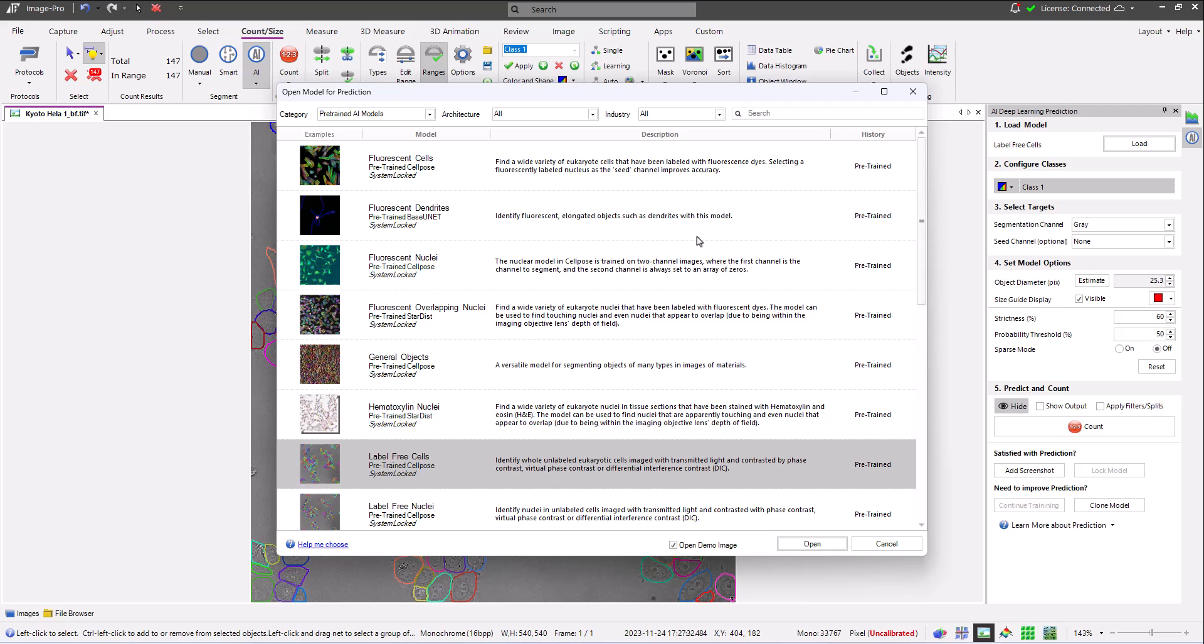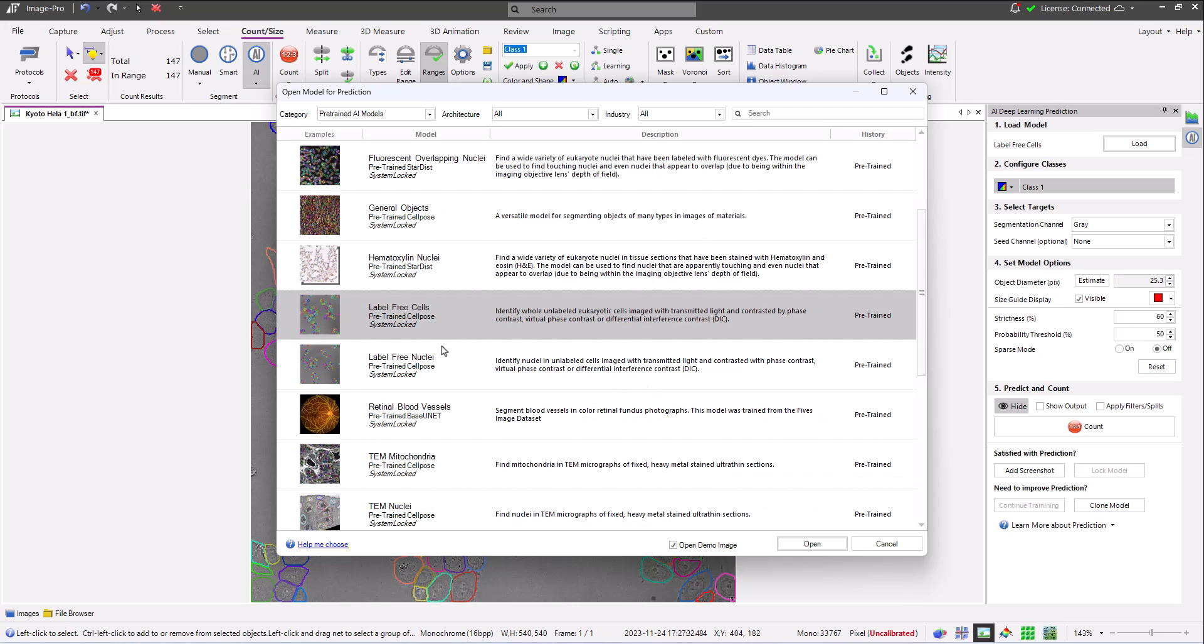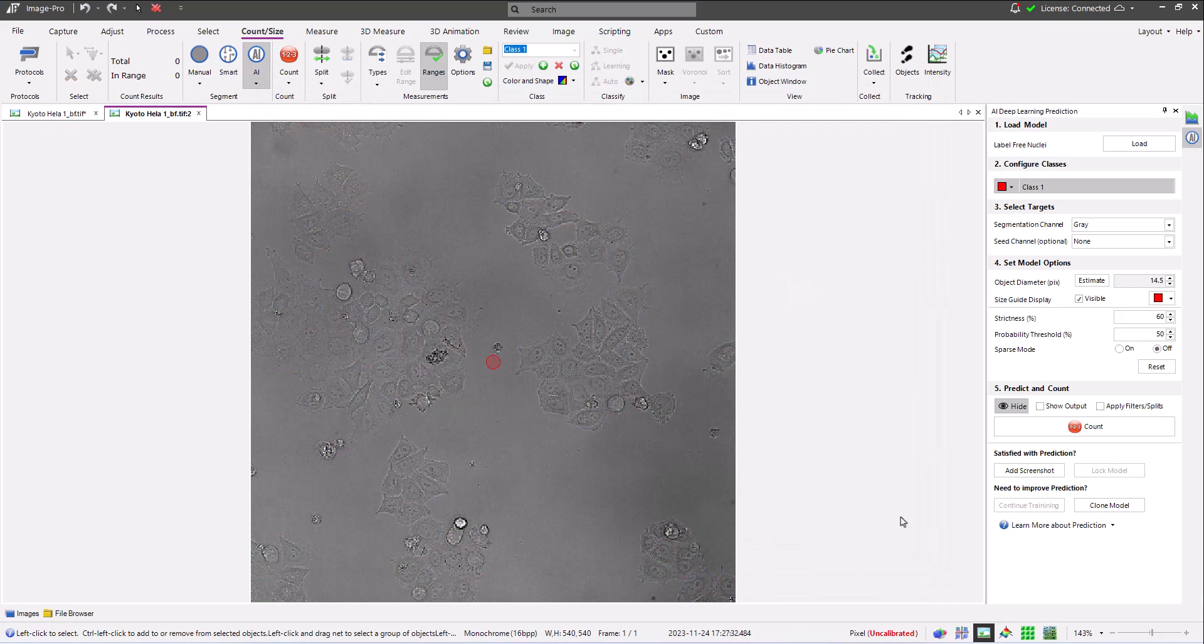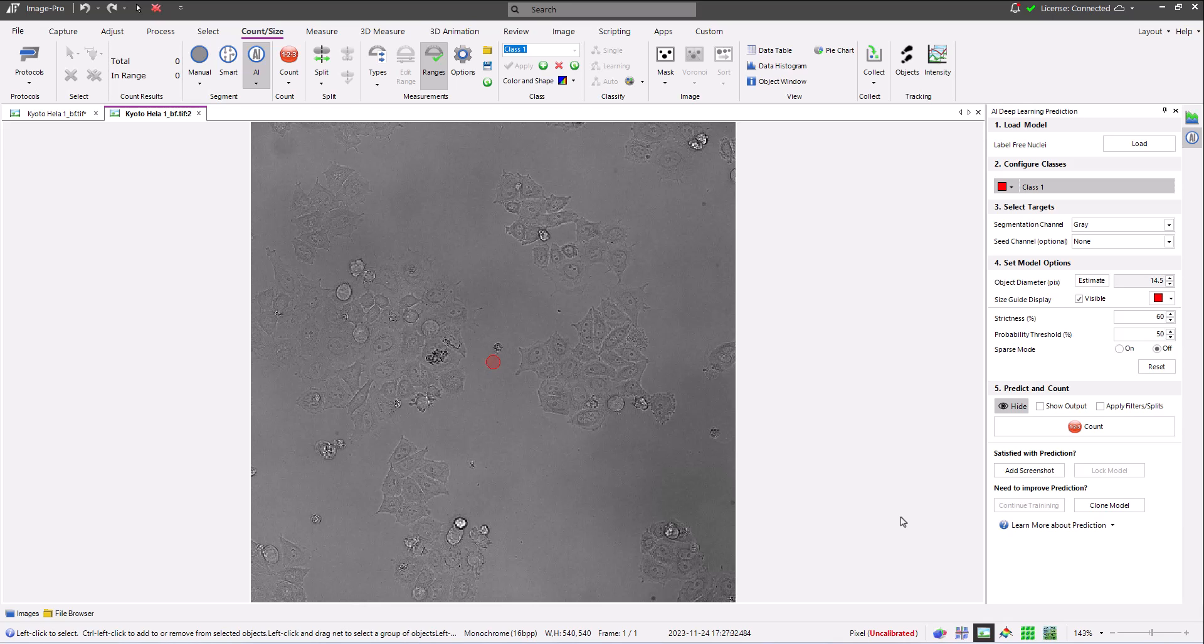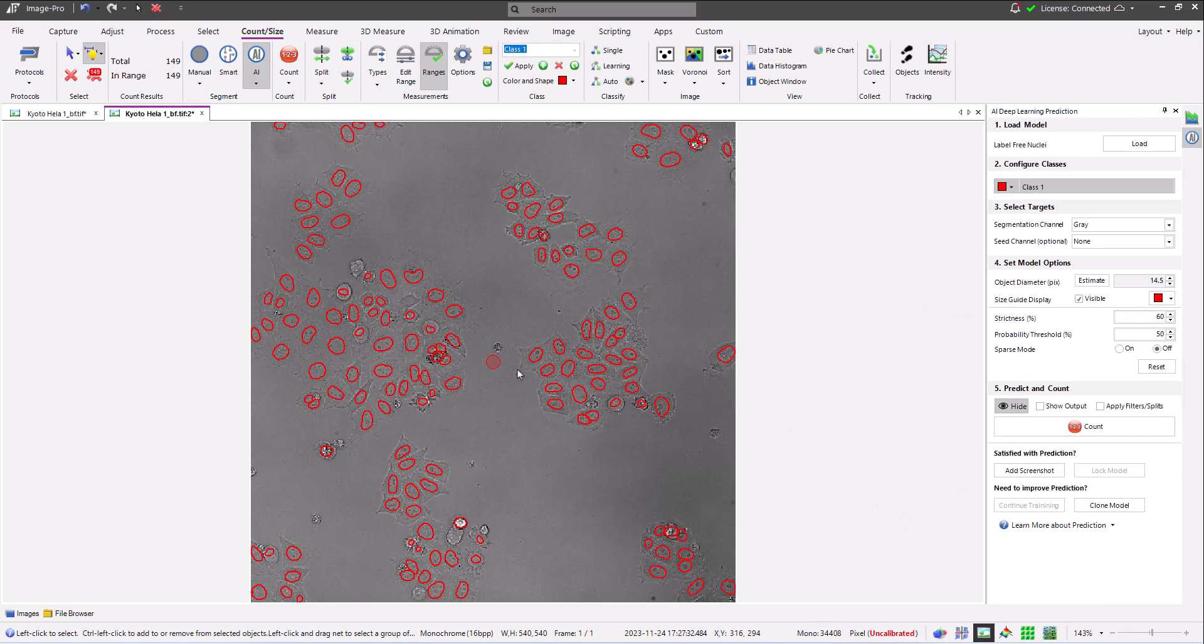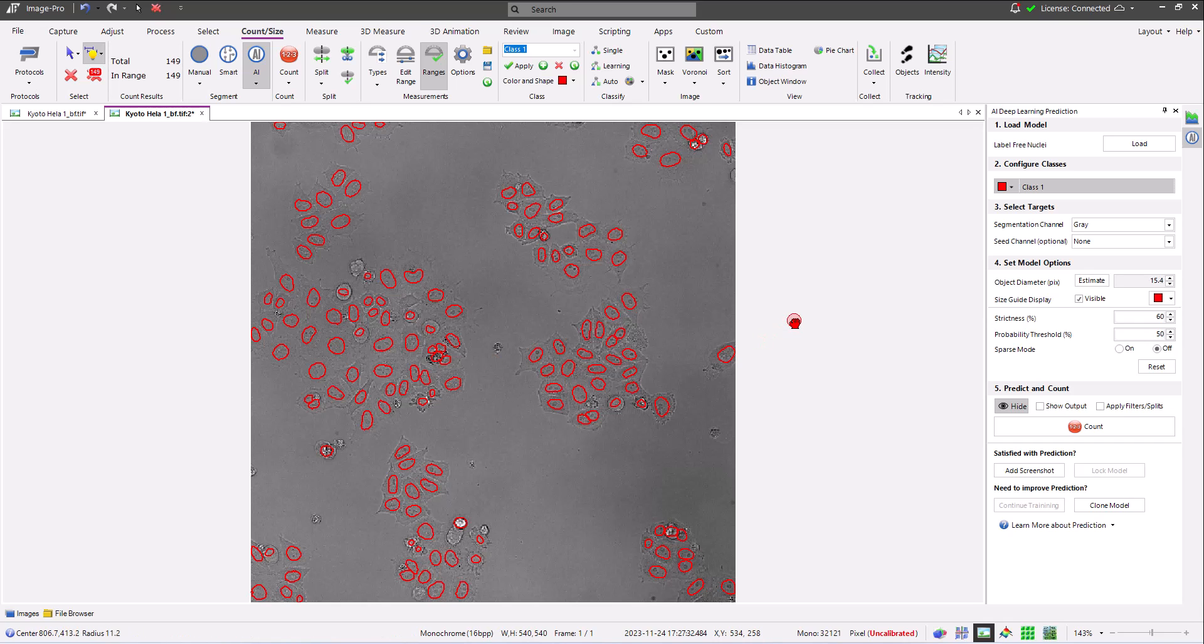Next, let's load the label-free nuclei model. Finding each nucleus in this image is another example of something that initially looks easy, but is in fact very difficult for computers with conventional segmentation methods. This deep learning model does an amazing job of segmenting each nucleus in the image.